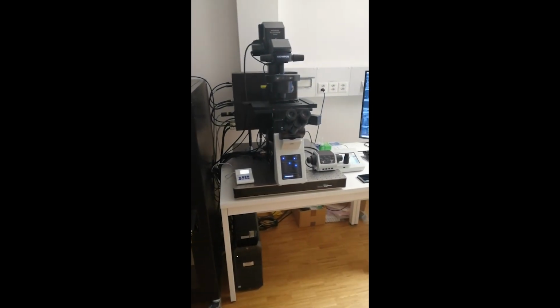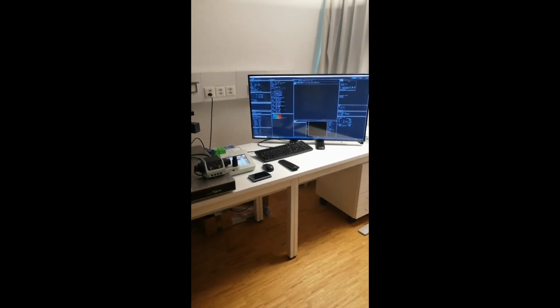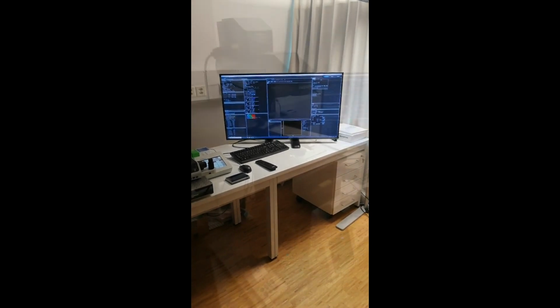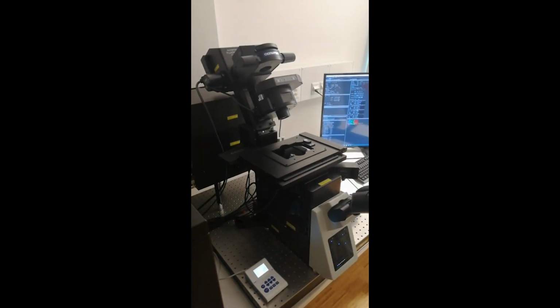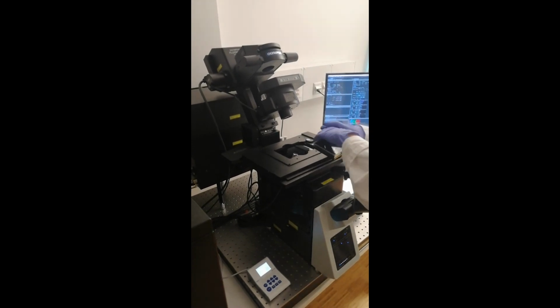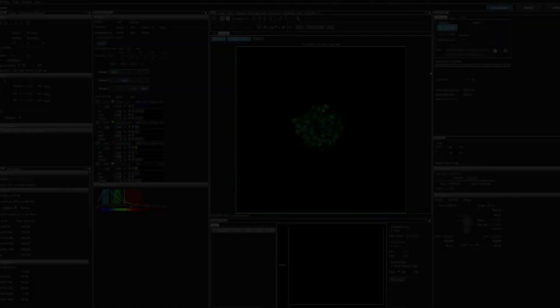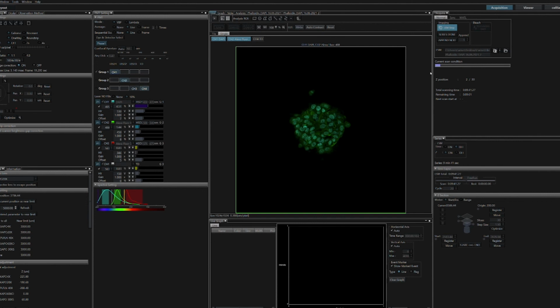In order to image 3D structures such as microtissues, laser scanning using a confocal microscope is the best method. Using confocal microscopy, the sample is illuminated with a point source of light, and we are able to take sectional images of the sample through the entire depth of it. Reconstruction of the 3D structure is operated by stacking these slices back together. The staining of the very internal part of the microtissue can be seen with better clarity using a confocal microscope. However, it is still not possible to image directly through to the core of the microtissues.